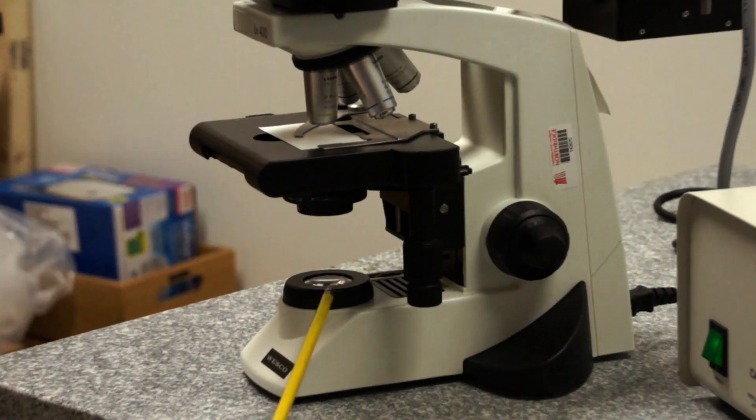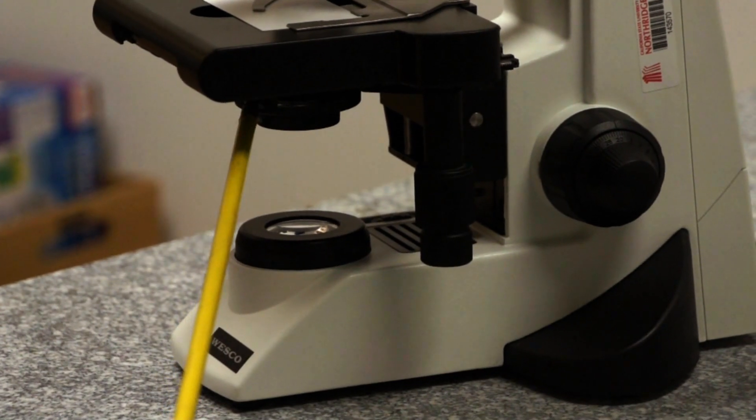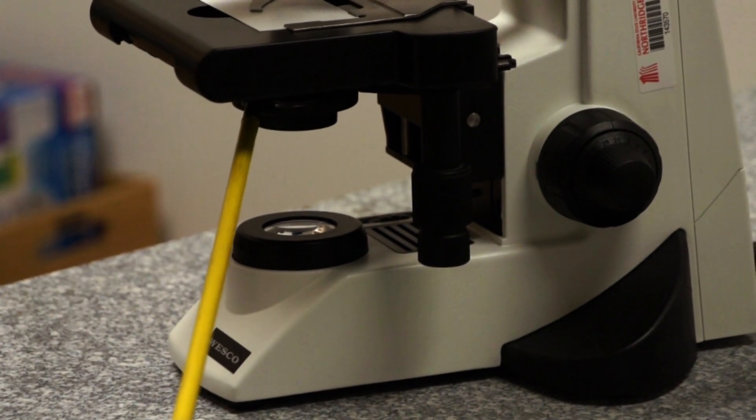The light travels through the field diaphragm and comes into the condenser. The condenser is an optical apparatus that does just as its name suggests. It condenses the light into a fine cone of light so that it can travel through the specimen on the stage, and then into the objective.